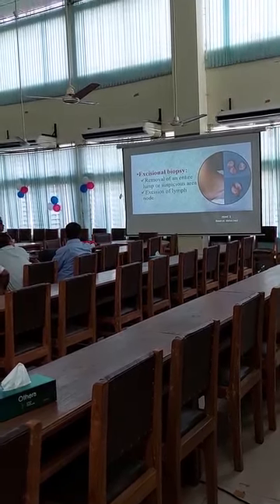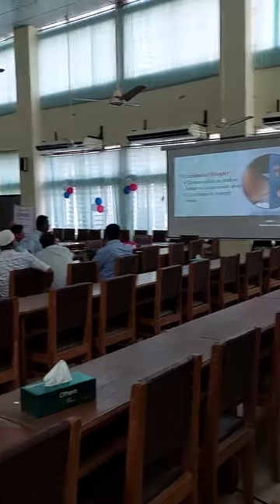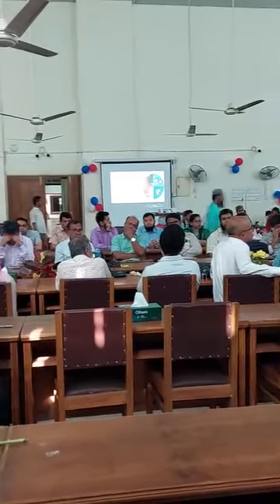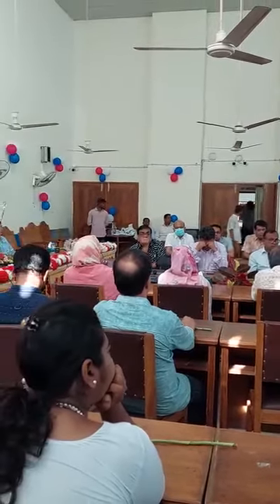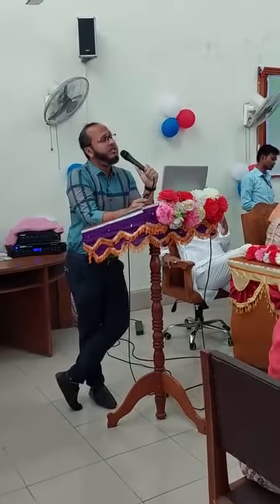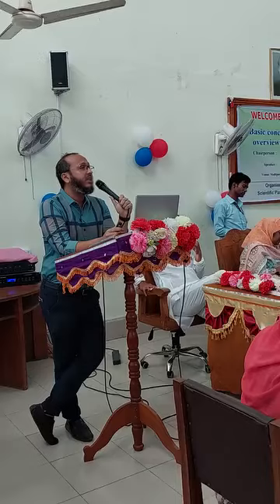In case of lymph node biopsy, we have to remember that if we suspect a case of lymphoma, we should excise one or two whole intact lymph nodes. The lymph node should be handled very cautiously because it can easily develop crushing artifact, and it should be fixed immediately after the excision with 10% formalin. Otherwise, it will autolyze. Because in lymphoma diagnosis, we have to see the follicular architecture as well as Reed-Sternberg giant cells, whether present or not.